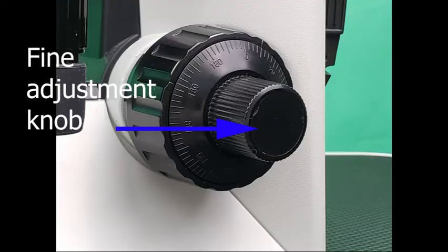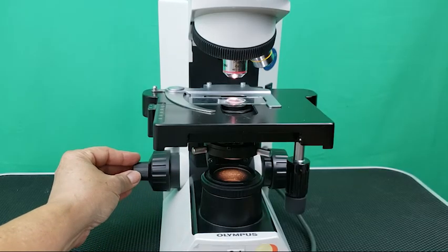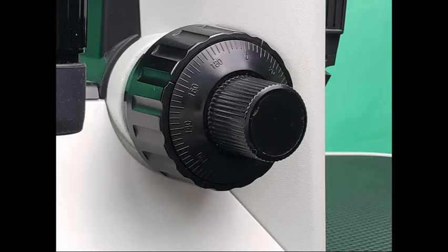Fine adjustment knobs: Two smaller knobs on either side of the base of the arm, usually located in the center of each coarse adjustment knob. The fine adjustment knobs yield extremely small movements of the stage for very precise focusing.